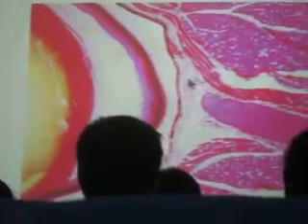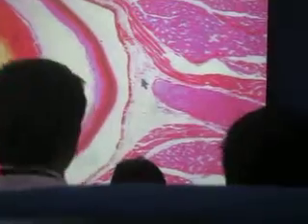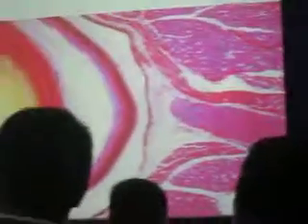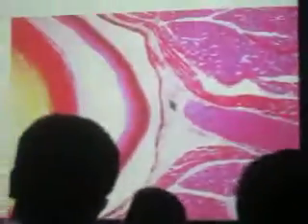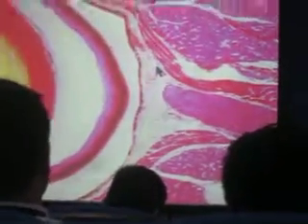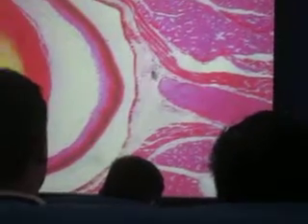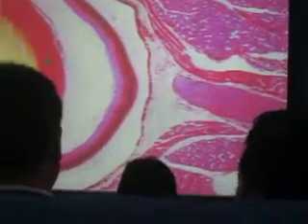So the sclera is homogeneous because it is made up of fibers, either collagen or some elastic fibers. Okay? It is opaque, as compared with the more anterior 1/6 of the fibrous coat, which is the cornea. The cornea is very transparent. Okay? So it is fibrous because it protects the rest of the inner eyeball.